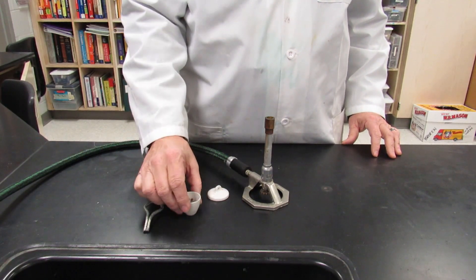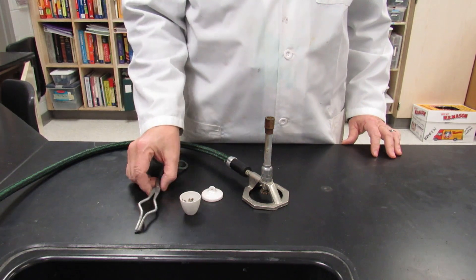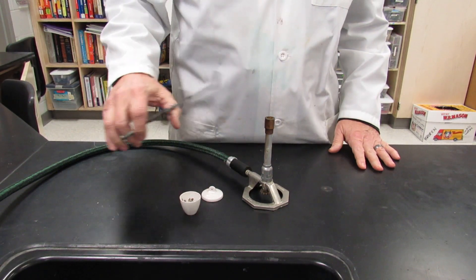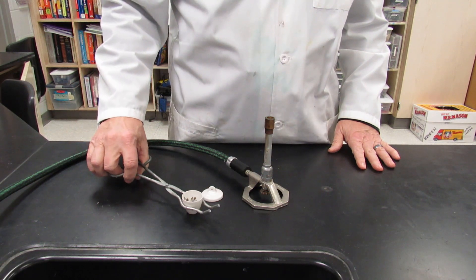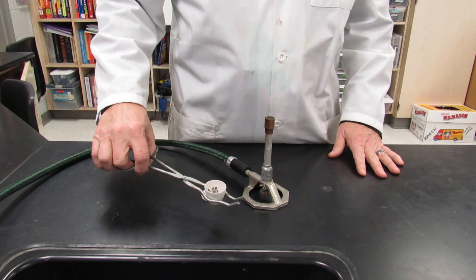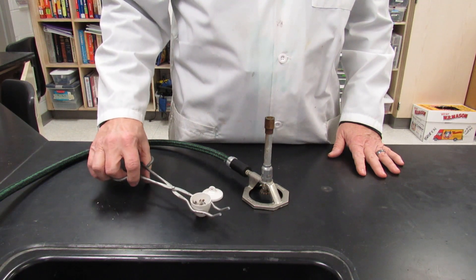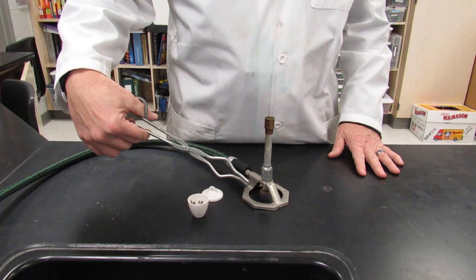When using the crucible tongs you're going to need to be able to grab the crucible with the tongs. It's designed to pick up the crucible in the little diamond shaped area. Make sure you pick it up easily. See the diamond shape?